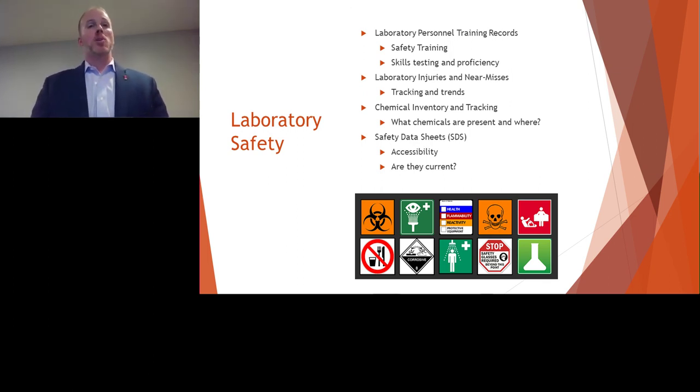There are a couple of programs out there that help you manage these safety data sheets, or it can be something that's maintained manually. But if you are maintaining them manually, you have to make sure you're keeping them current, so that if you have acetone or something that's in the laboratory all the time, you are maintaining the most updated version of those SDSs, those safety data sheets, because they do change periodically, and some change between different vendors.